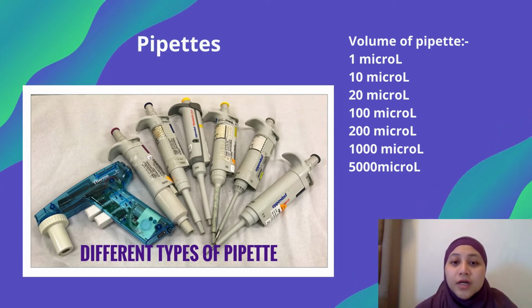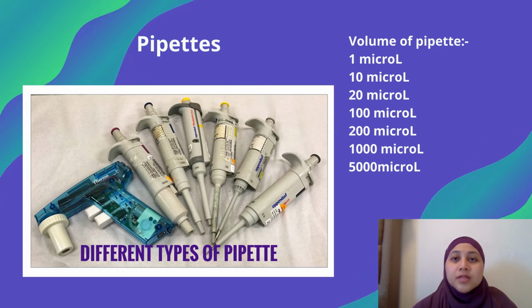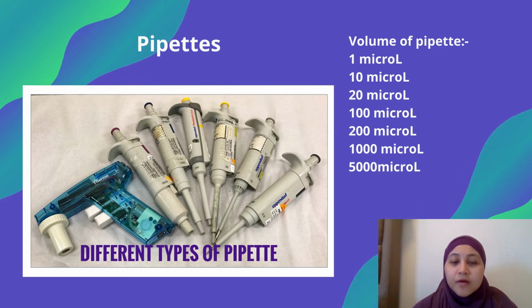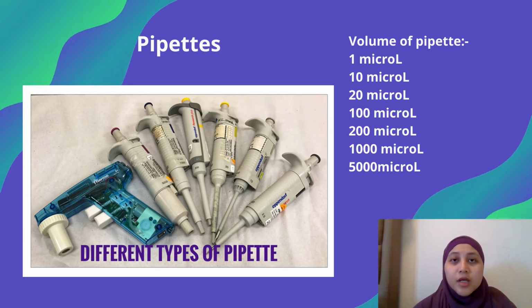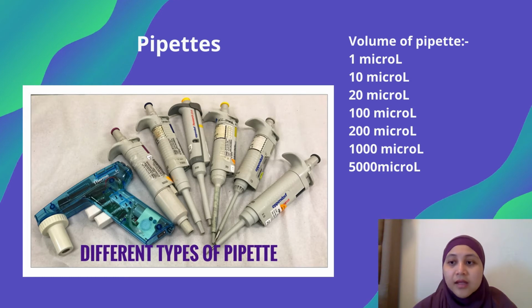At the end of the pipette, there is a narrow end and it is where you connect to the tips for suspending the volume. Before using the pipettes, you have to make sure that the equipment is maintained and calibrated.